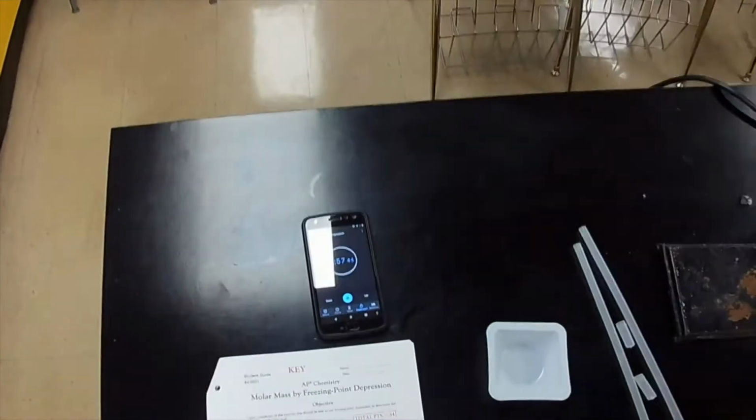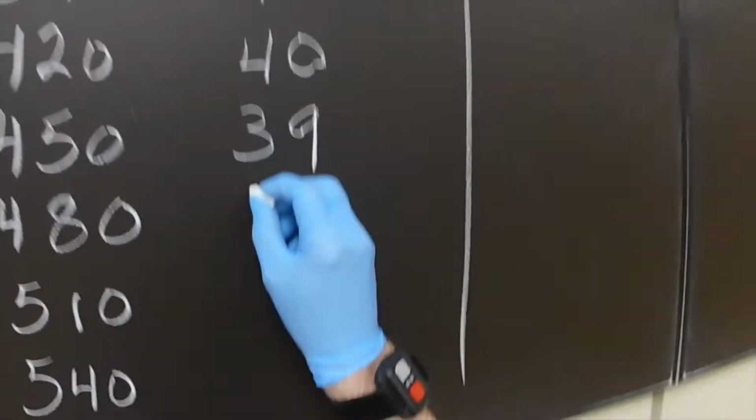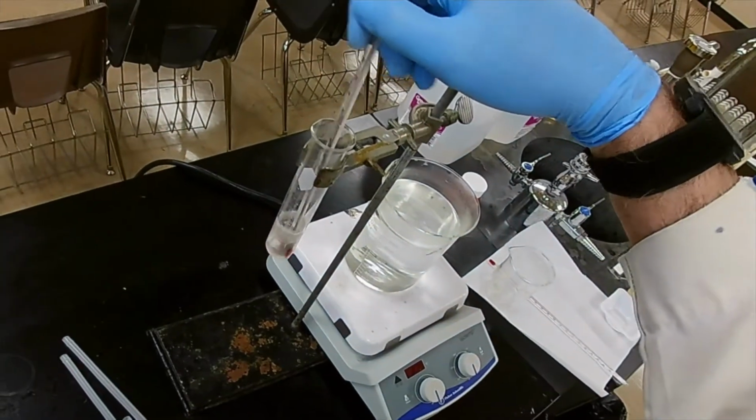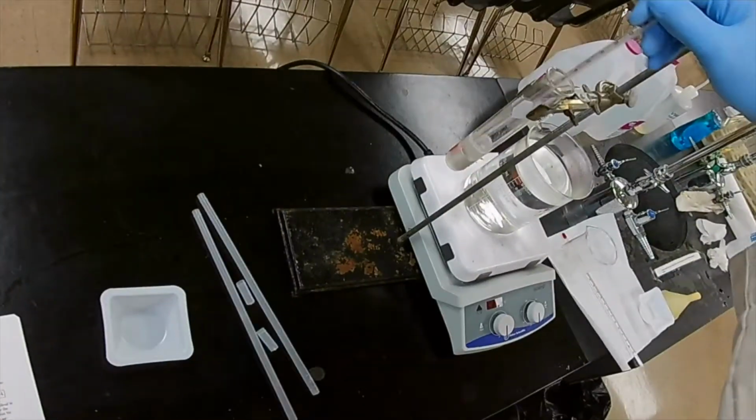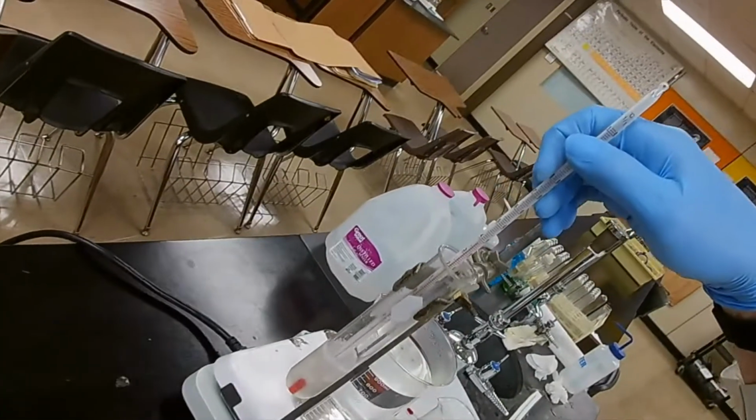Next measurement. 2, 1, now. 38. 38, still dropping. 38. I think I see something happening here. Yeah. It's getting cloudy. Let's see if this one holds steady at 38. Yep. 38. That happened quick. Very quick.